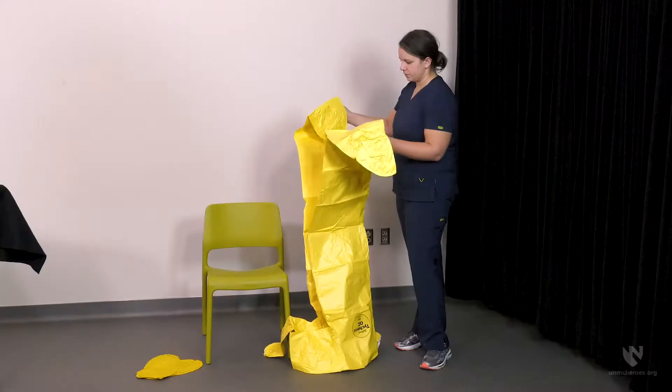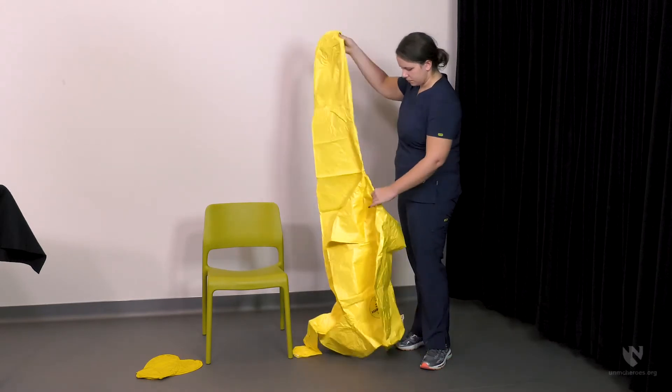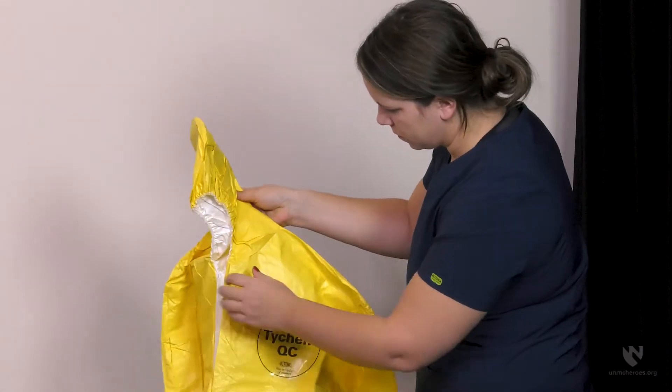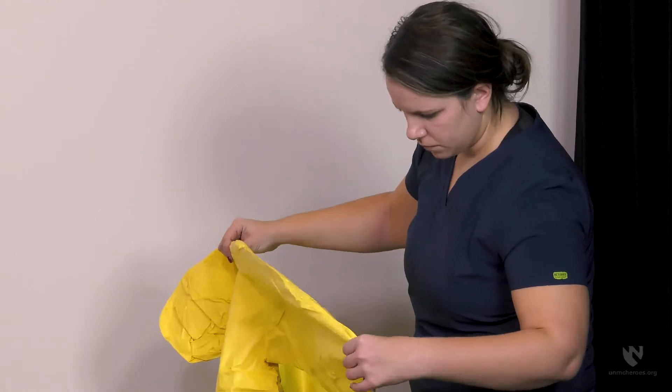To begin the donning of the suit support equipment, carefully inspect the seams of the suit for tears or broken seals. You should select a suit that is at least one size larger than you would normally wear. This will allow for greater freedom of movement.